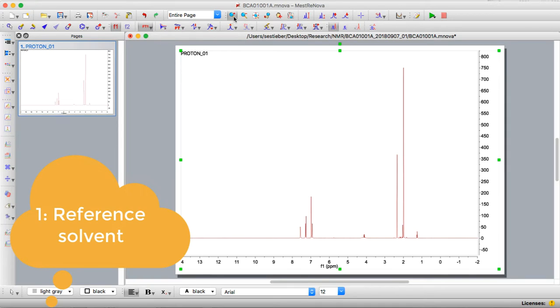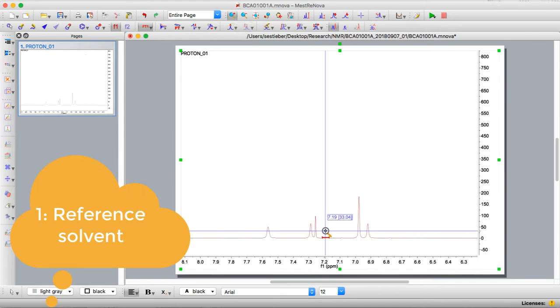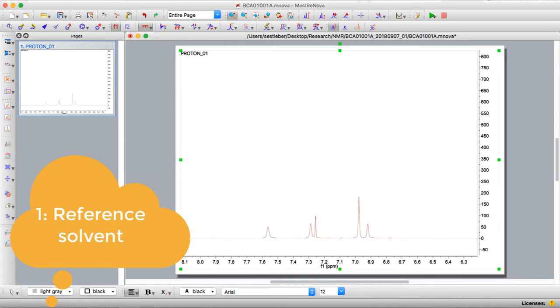I'm going to click on the zoom button and zoom in on this region because I know my solvent is chloroform. Typically the NMR already automatically shifts the spectrum approximately to the solvent, but it's not always perfect, so you always want to go through and do it manually as well. In this case I know chloroform has a peak around 7.25.